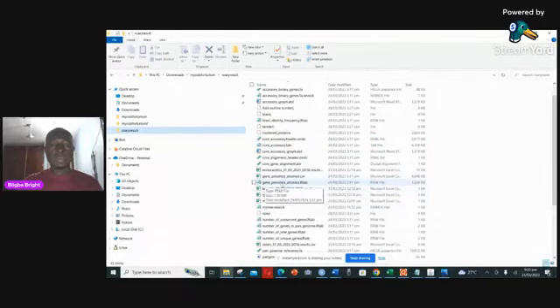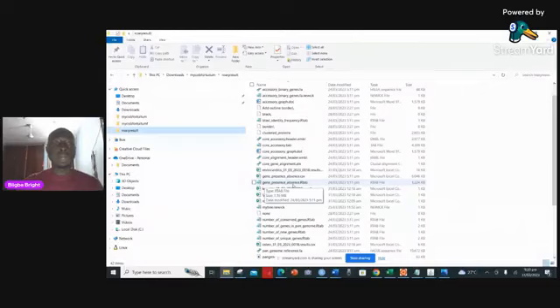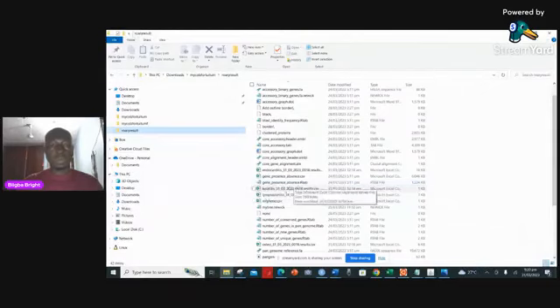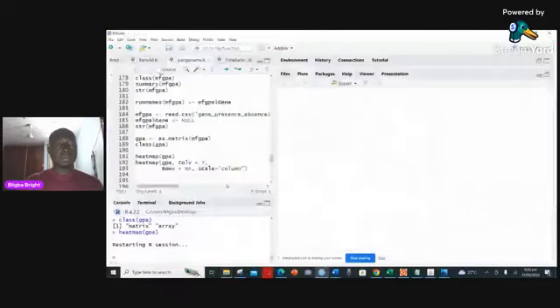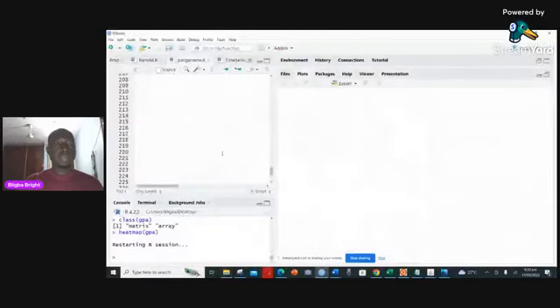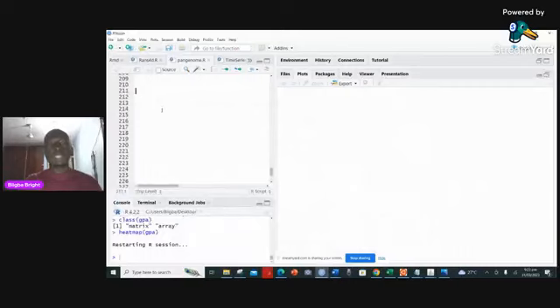When you have files like this, you can see there's one called gene presence and absence R tab, which means we can actually visualize this in R programming. If you know how to use R, I'm going to show you how to do that in about five minutes. An R tab means we can import this particular file into R Studio.